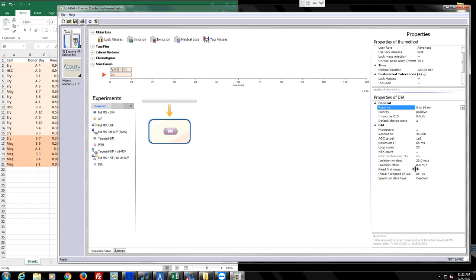I suppose so. Honestly, it's not really something I've optimized. On the Fusion series, I usually just plug in like 150 to 2000. But I think there's no reason on the Orbitrap to not have it scanning the full range. I mean, unless you're trying to go really high mass to charge, then it would alter some of the lenses for optimal transmission of those higher m/z species. But I think for DIA, generally you want to scan everything. I don't see why they would have it be narrower.